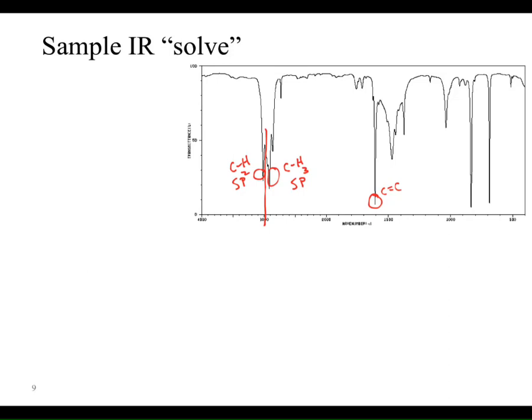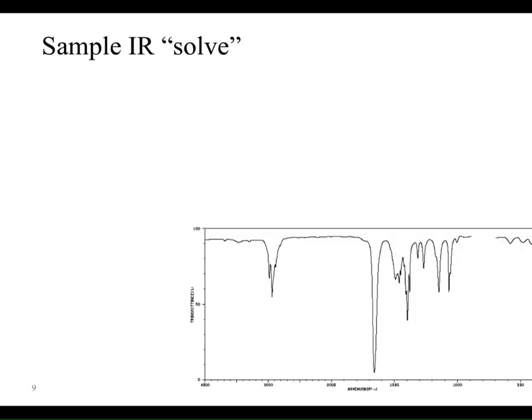Okay? And the 4th one. Here we go. We got another spectra. Take a minute to pause. Do what you can. And here we go again. Wow. Okay, so this one becomes a little bit harder. Usually I'd recommend a ruler. Oh, that's sitting right on the line. I would call this CH sp3.